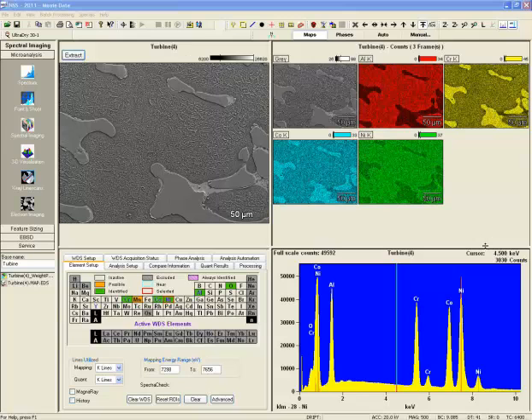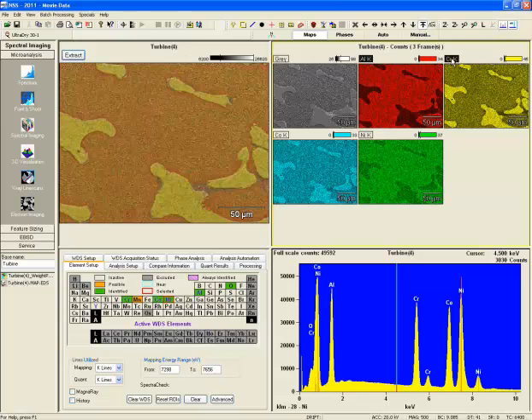Once the spectral imaging data is collected, it's not enough just to have the elemental distributions. The analyst is usually interested in understanding what the compound, alloy, or mineral distributions are within the material. One way of doing that when you only have X-ray maps is to overlay the X-ray maps onto the electron image, and look for color changes in the overlays indicating where some of the compounds, alloys, or minerals may be.